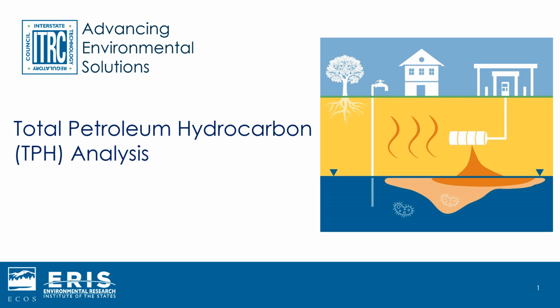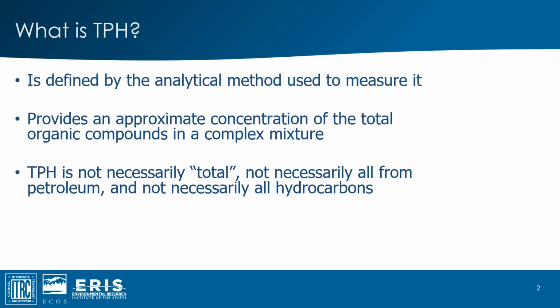TPH is a complex mixture of chemicals. So what is the best way to look for TPH in the environment? In this video, we will discuss common analytical approaches for TPH and how your selection of analytical method can impact your site characterization.